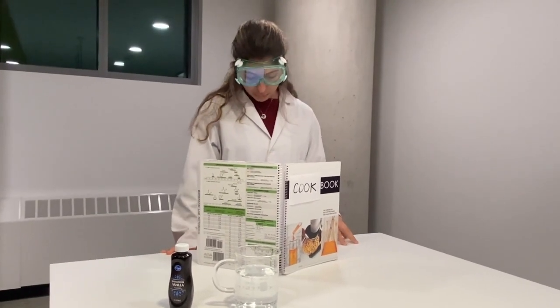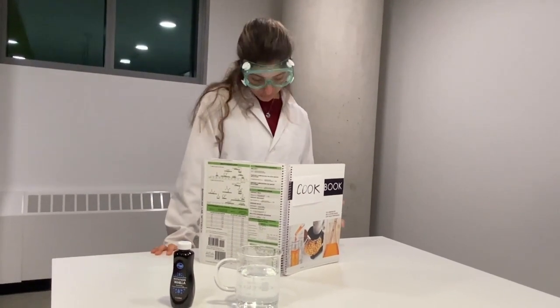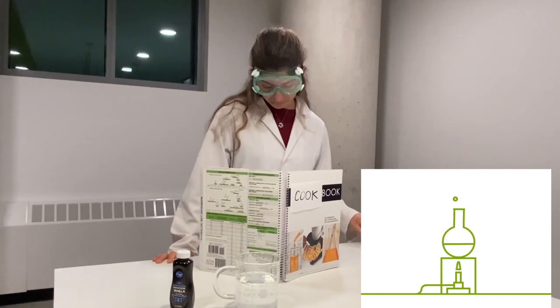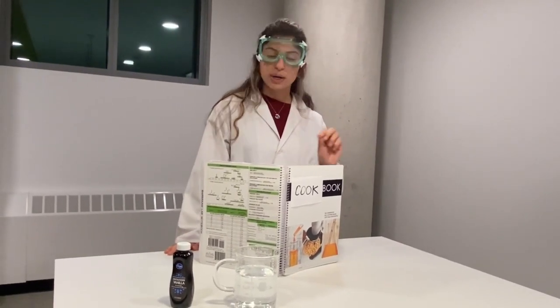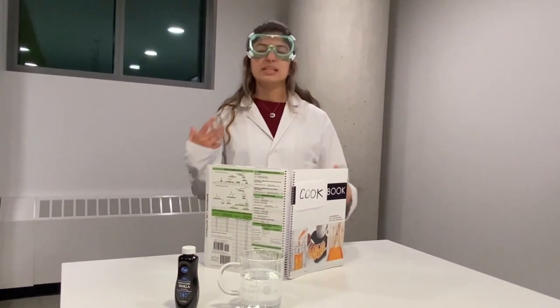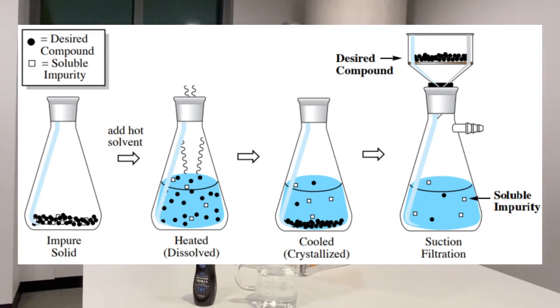Alright, so now you're wondering, what do you do with this mixture that you have going? Similar to how you might cook in the kitchen, you're going to heat the whole mixture to 50 degrees Celsius in an air-filled environment. For your next step, you're going to separate the organic solvent from the aqueous solution via extraction. And then you're going to conduct a crystallization, which is going to isolate the p-hydroxybenzaldehyde.